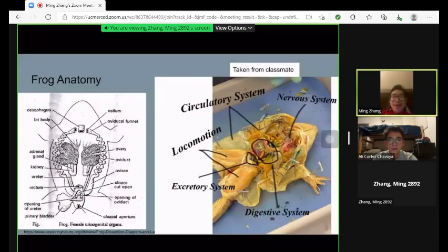While we did not dissect the frog ourselves, we were able to obtain a good picture of one from one of our classmates. Here, on first glance, the bodily system most readily apparent is the circulatory system. On the skin, you can see quite a number of veins running through it. Though most animals have blood running through their veins, frogs are able to breathe through their skin, making it a place where gas exchange takes place.